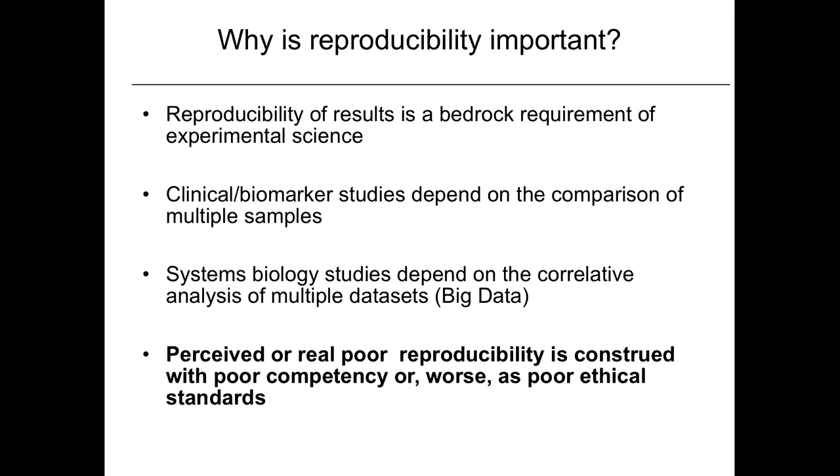And then, we alluded to that a little bit on Monday, systems biology studies rely a lot on machine learning, correlative statistics, and so on. Basically, we work with large data sets where many samples of a cohort are measured, and we try to extract some information on how the system behaves under certain conditions. And of course, here the data would also need to be reproducible.